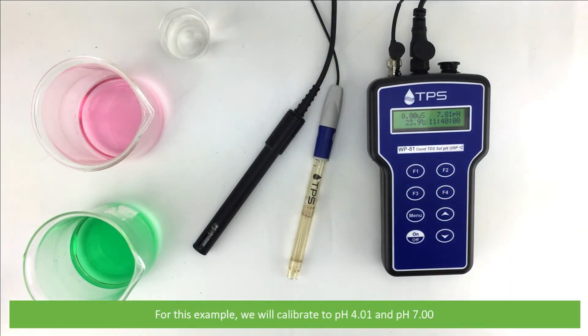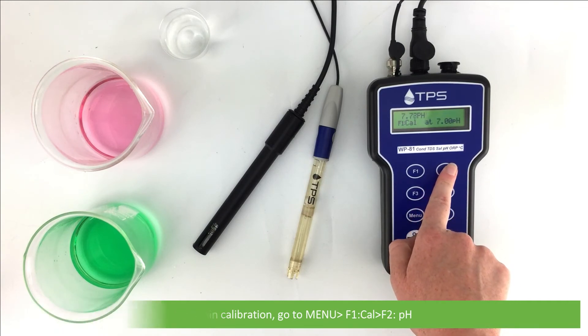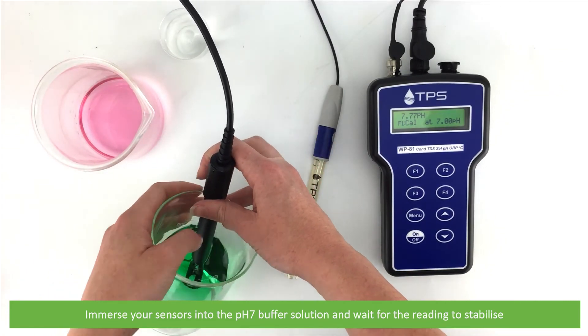For this example we will calibrate to pH 4.01 and pH 7. To begin calibration, go to menu, F1 cal, F2 pH. Immerse your sensors into the pH 7 buffer solution and wait for the reading to stabilize.